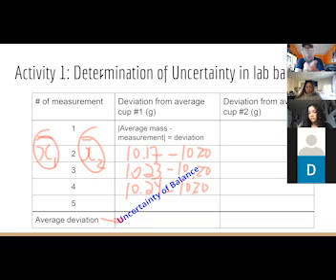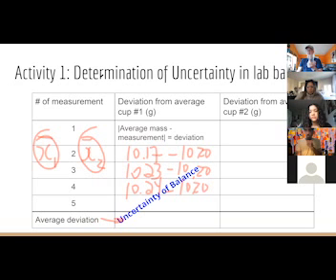Not really. I mean, there'd be some deviation, like I said, like the more we handle it, the more mass we're adding to it. So yes, there's some deviation that comes from us, but mostly the deviation comes from the balance. How accurate and reproducible is the balance? So if we're doing them relatively at the same time with relatively the same mass, I can't guarantee, but I would think the deviation should be pretty much the same. Fingers crossed, that's going to happen.